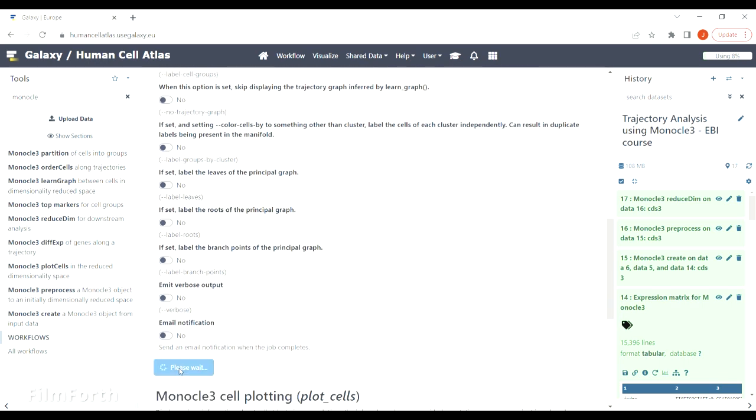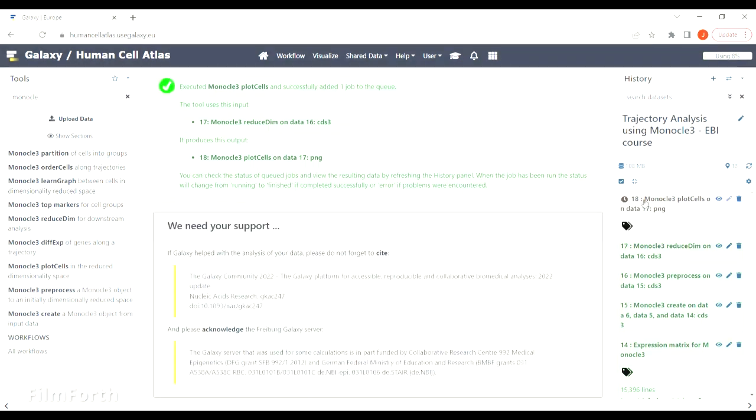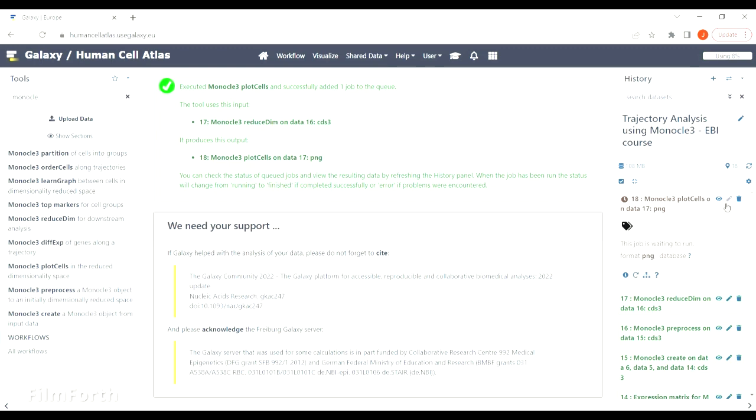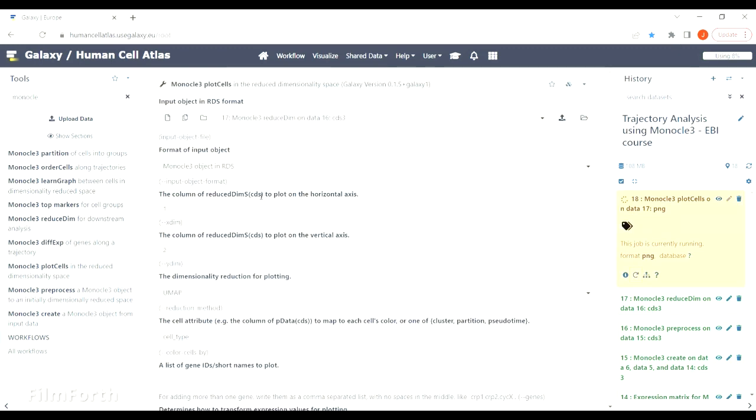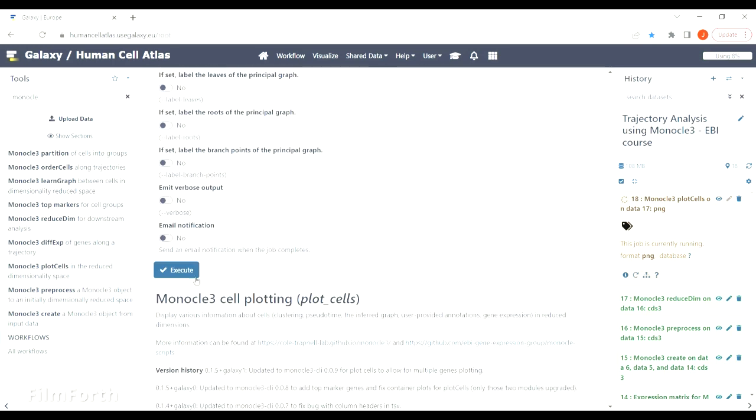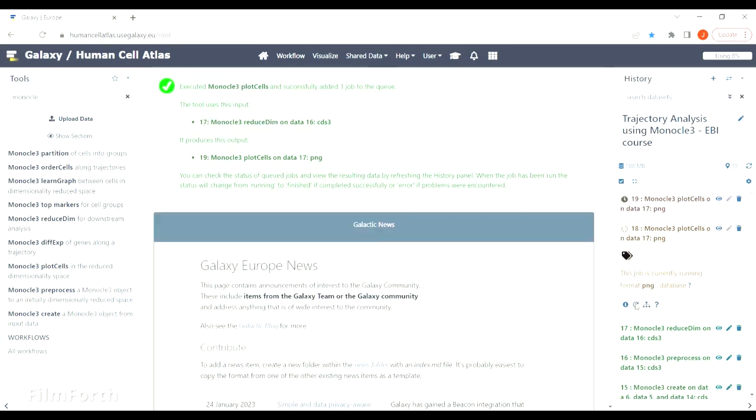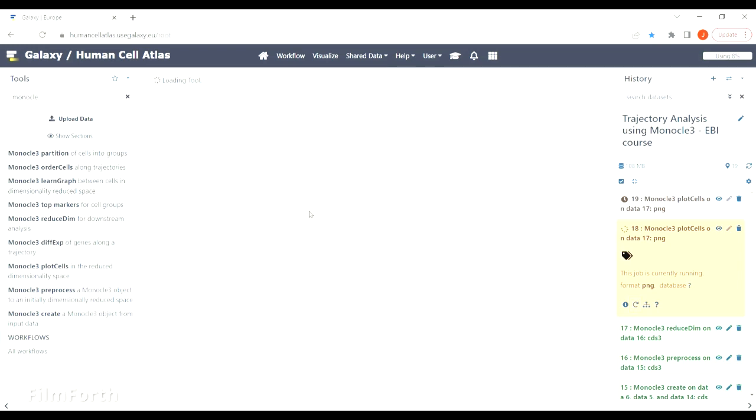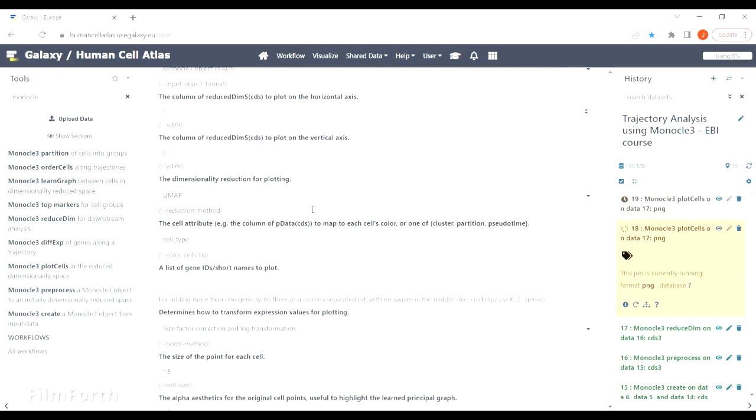In our case that was cell type, genotype, batch, and sex. You can always go back to the files we used at the beginning to check how those names are spelled to avoid any typos and errors.